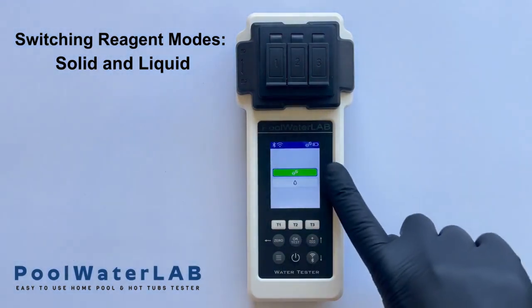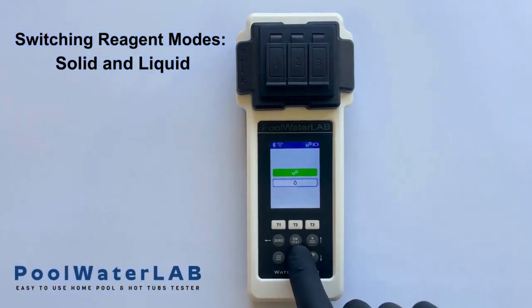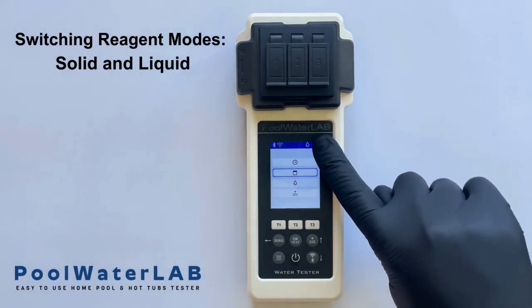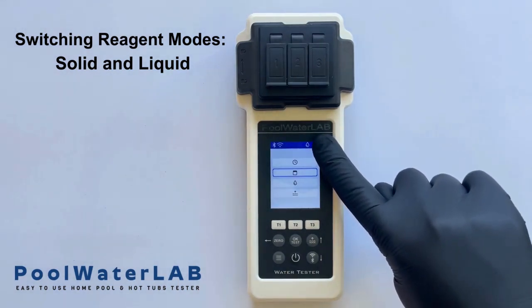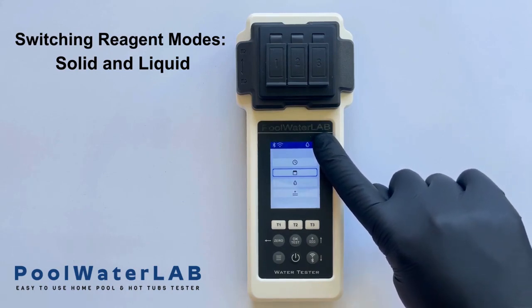In this menu, you will see two modes. For this demonstration, we will select liquid mode. Press OK to confirm your selection and proceed. You will see the icon at the top right corner of the screen change to a liquid symbol, indicating that the tester is now set to liquid mode.